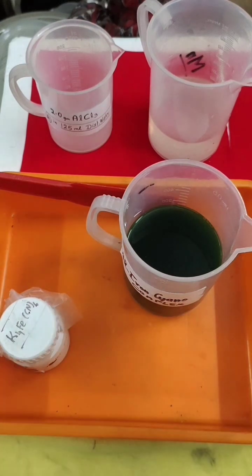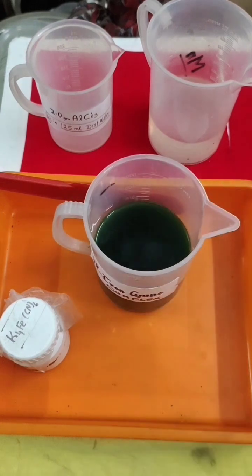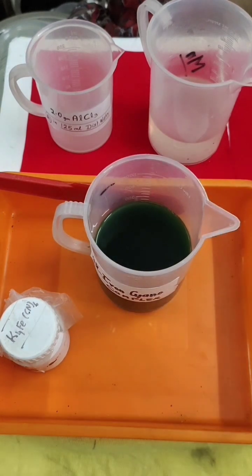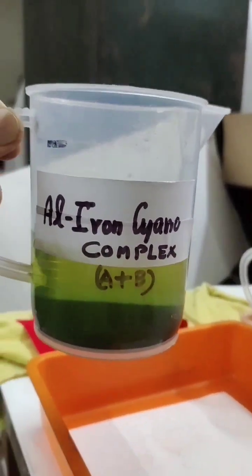Decant off the upper water layer and throw it out. The remaining will be the cyano complex. This we have to sun dry. If you are in a laboratory you can do it in an air oven, which will be faster — sun drying takes more time. I'll show you all of this step by step.